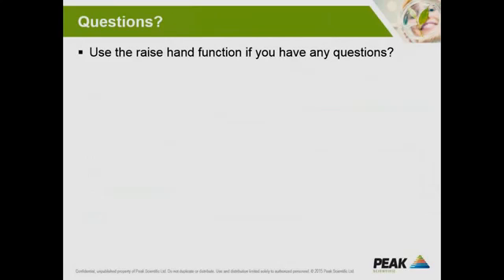Okay. Thanks. So the next question is, do you recommend the use of moisture traps? Are they actually really required? We would recommend to go with the trap recommendations of the GC manufacturer that you use. Just for example, with Agilent, Agilent would normally recommend for carrier gas moisture and oxygen traps, or you can get a carrier trap.